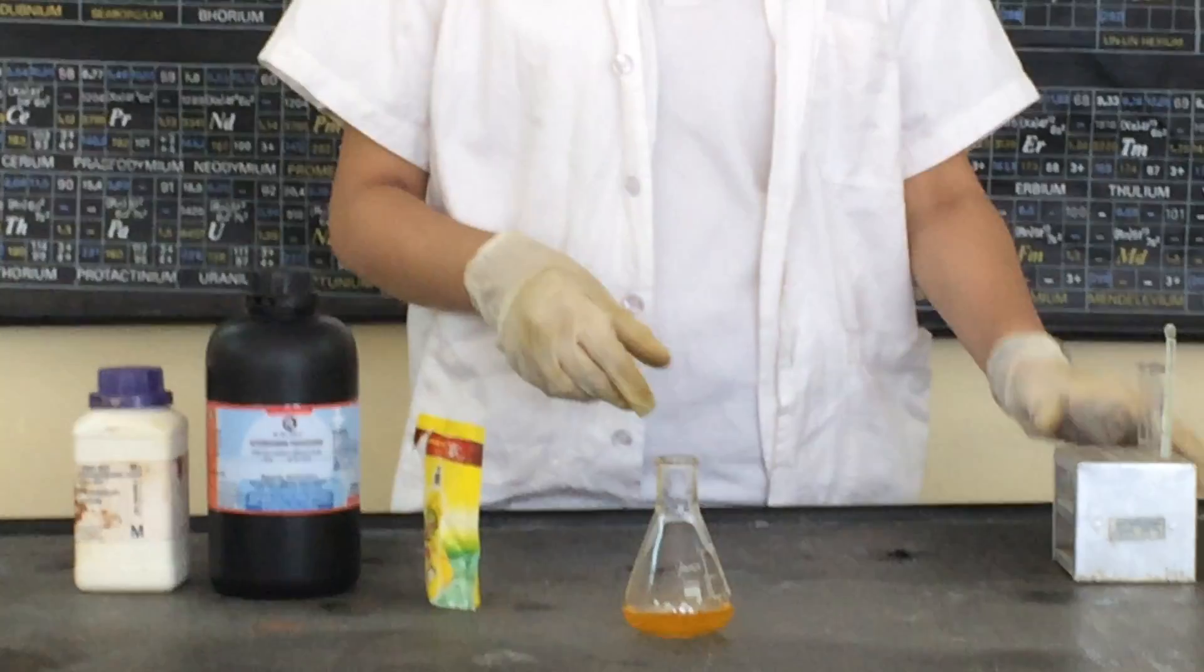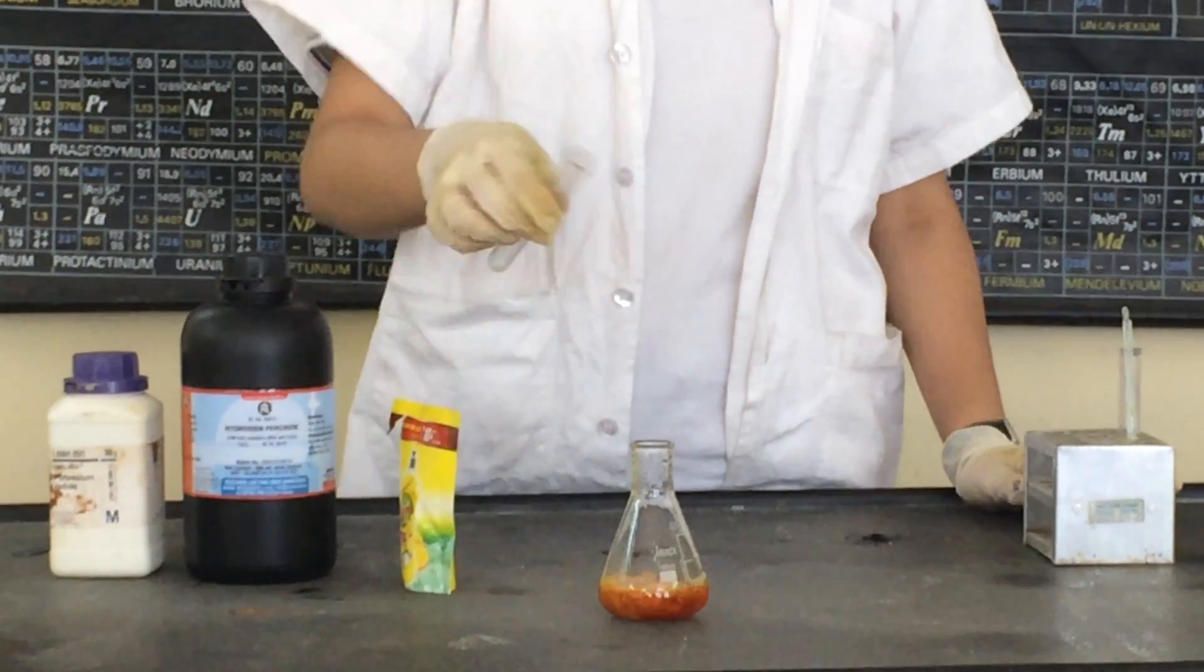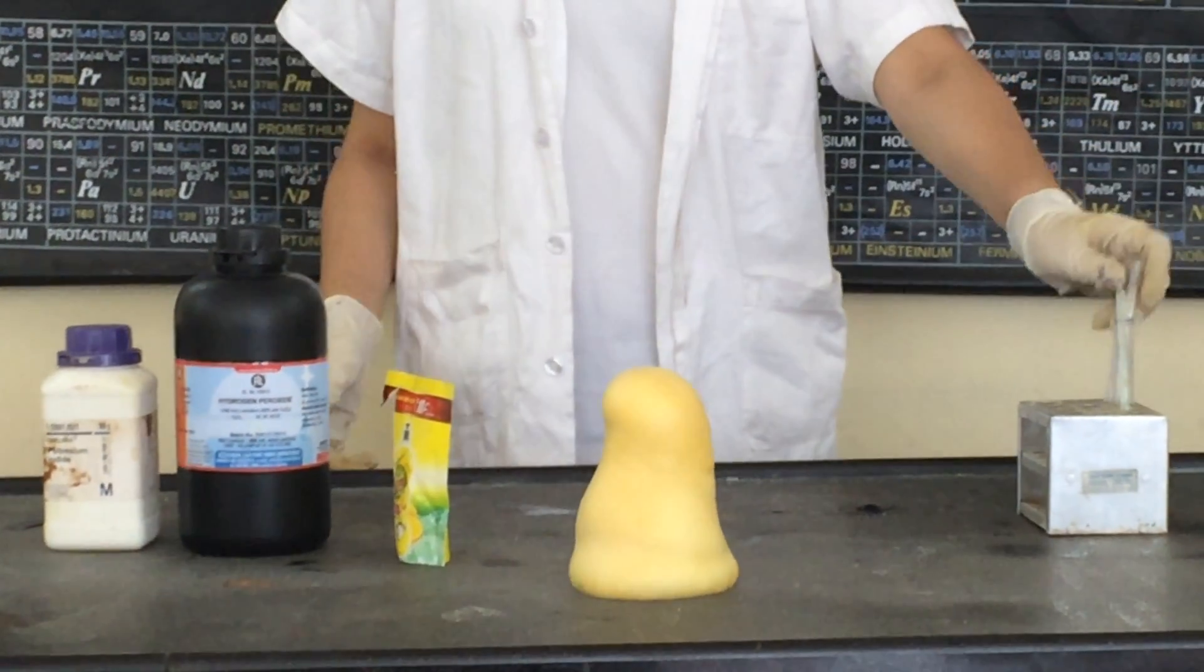So here is the final step that I will be taking. I will pour potassium iodide into H2O2 with the liquid dishwasher. And this is the result you will get.